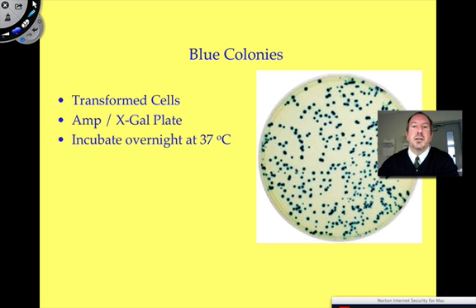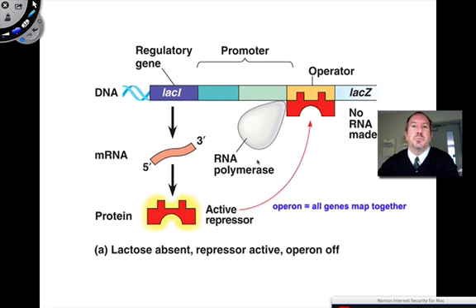And so in order to get the bacteria to grow, they grow very quickly. They often divide every 30 minutes or so, and if you give them a lot of good food, they'll be happy with that. But you do want to speed it up by growing them at a warm temperature, 37 degrees, which happens to be our body temperature. We can put them in a water bath, or we can put them in an oven incubator, and that's what we will do.